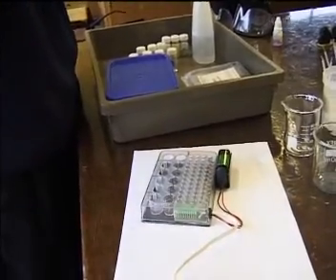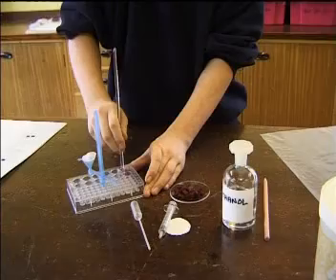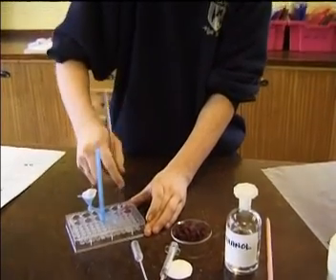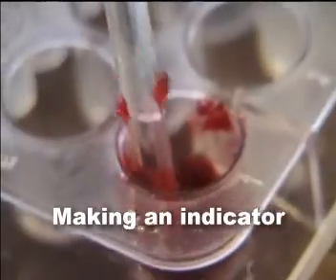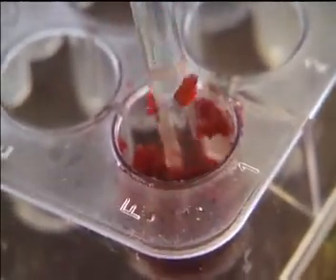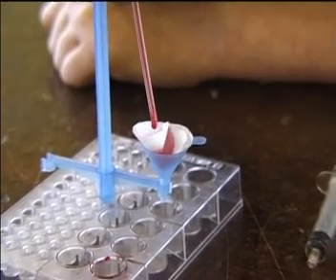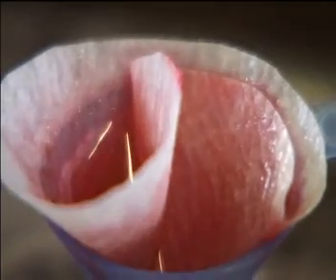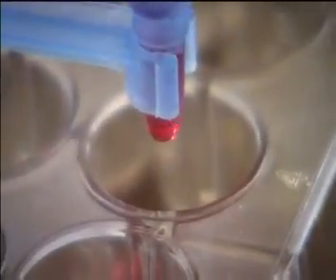Well, I think it's going to be a lot safer than when we use like half beakers full in class, because if you spill it, you're going to ruin the whole clothes instead of just getting one patch. If we use toxic materials, we only use small quantities of them. We don't get lots of nasty smells, so it's much safer. I feel a lot safer because there isn't as much glass in the equipment as there would be with normal equipment, and you're a lot less likely to break anything.